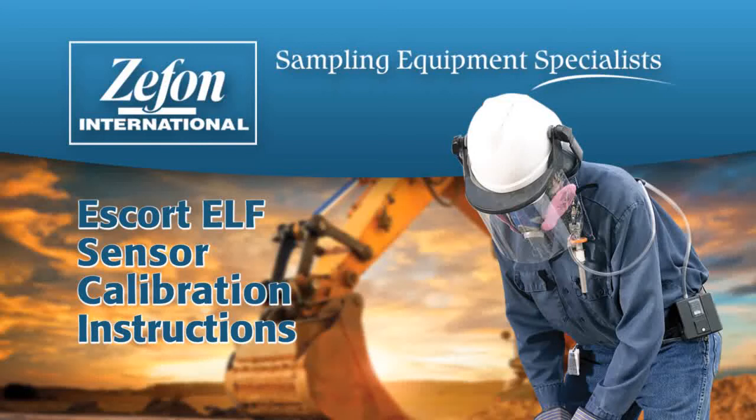This video is designed as a brief instruction on how to calibrate the Escort Elf pump. These instructions are also available in the operating manual.